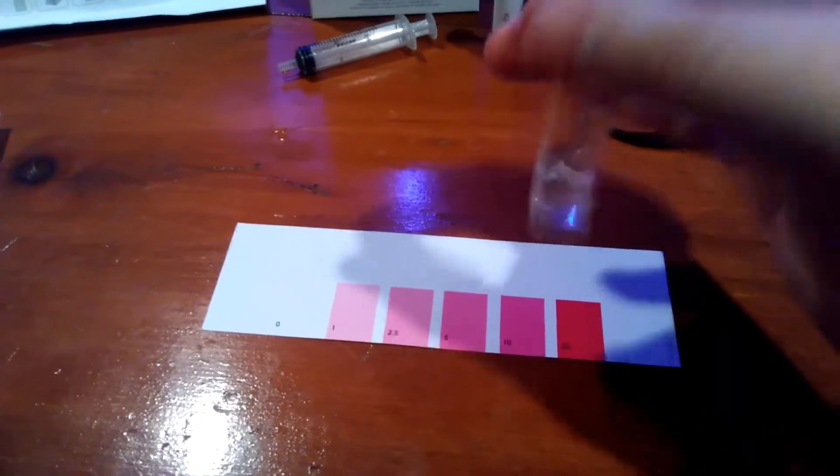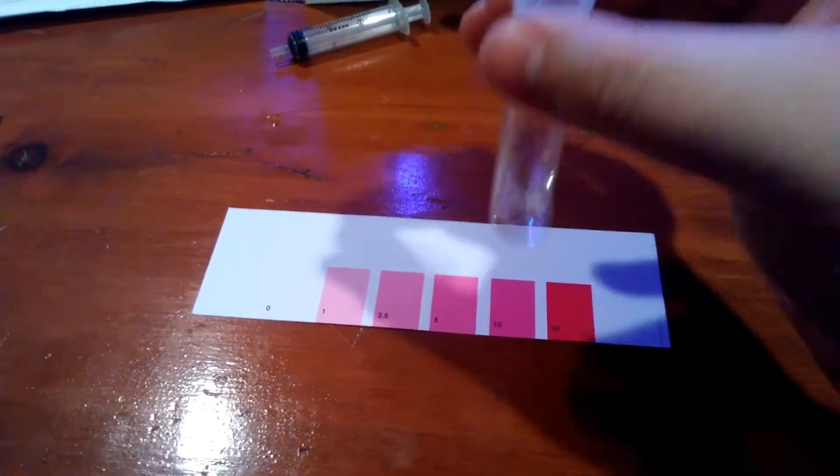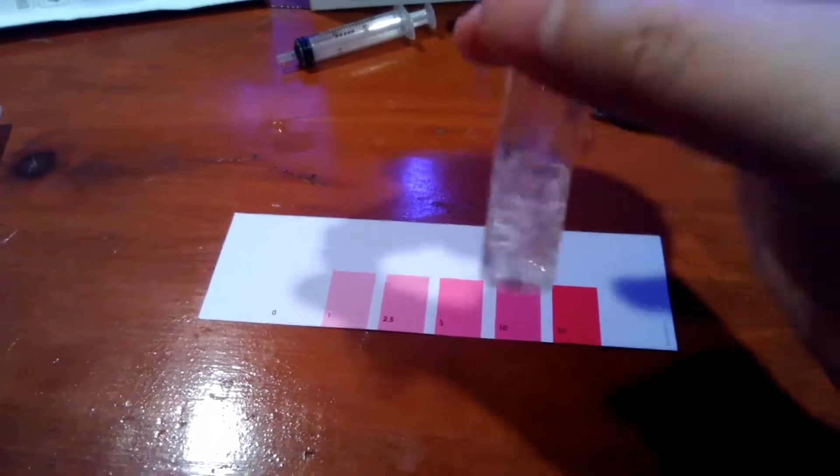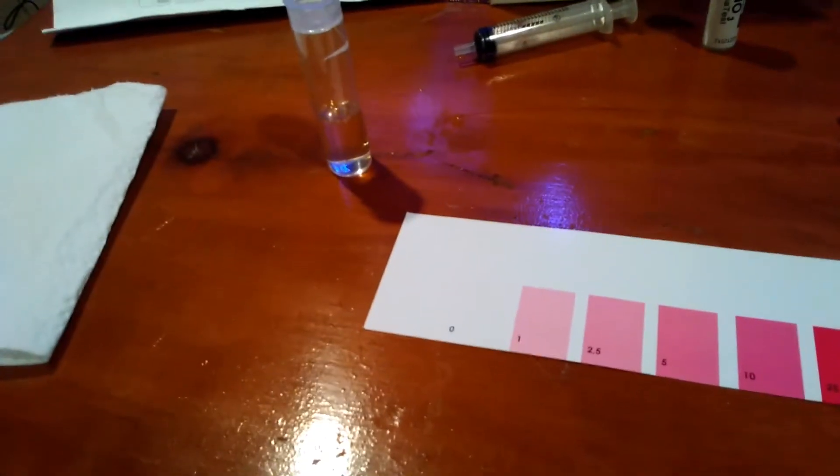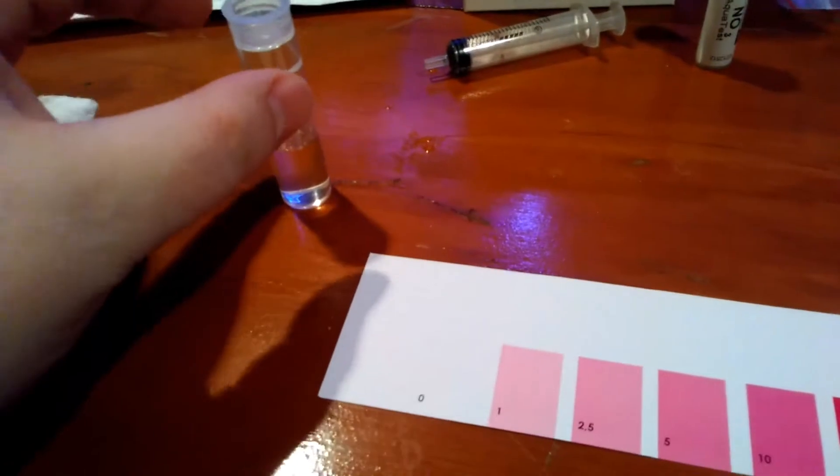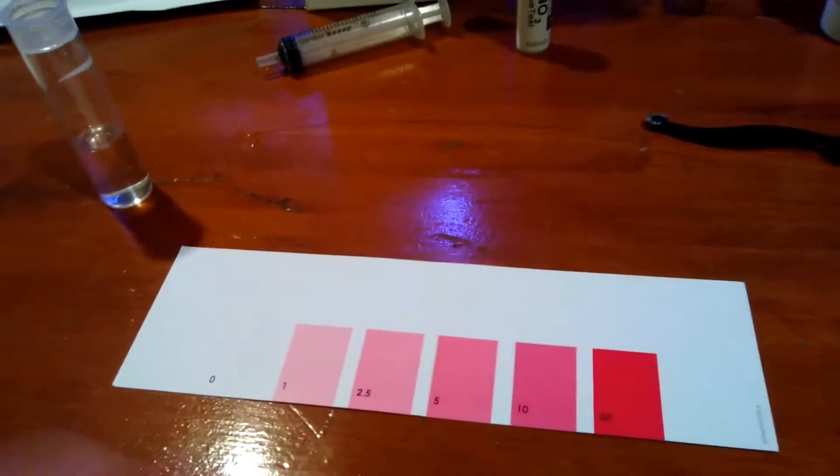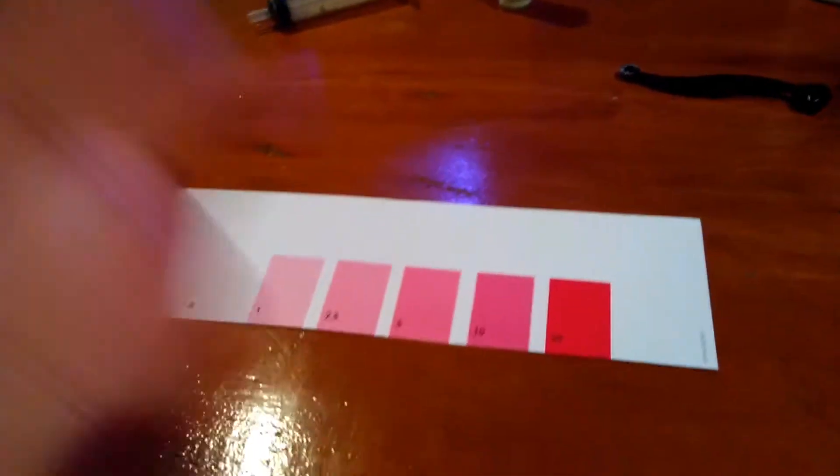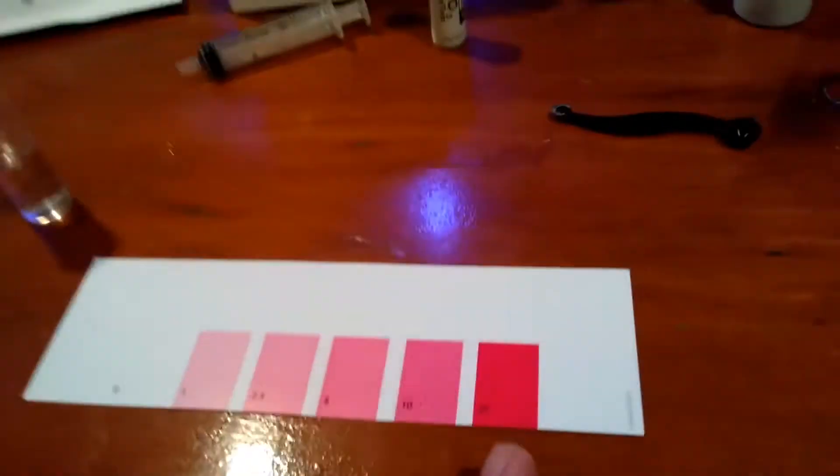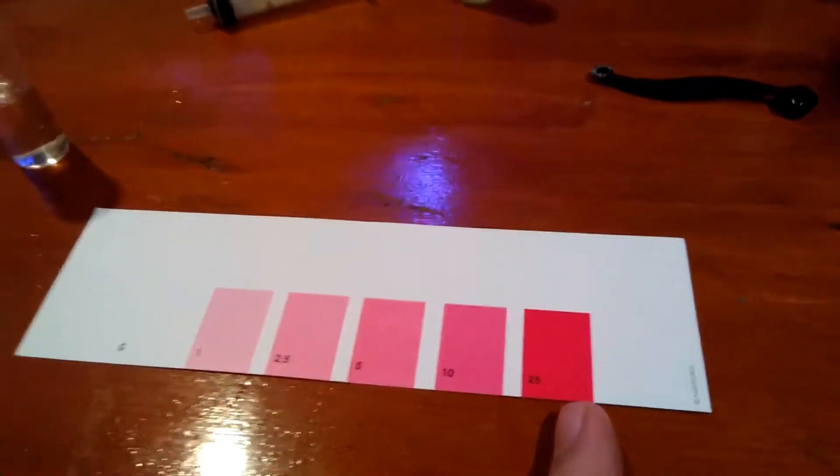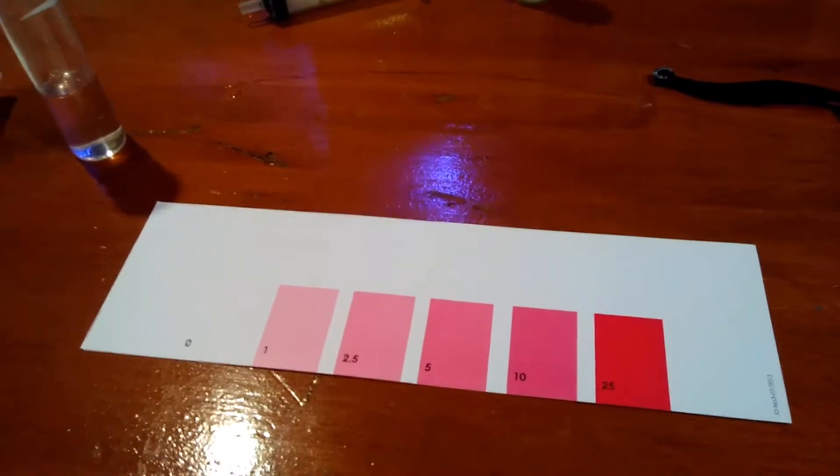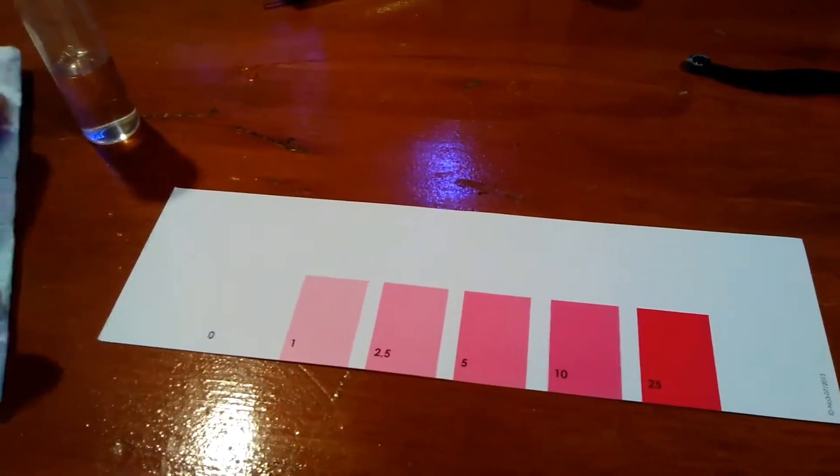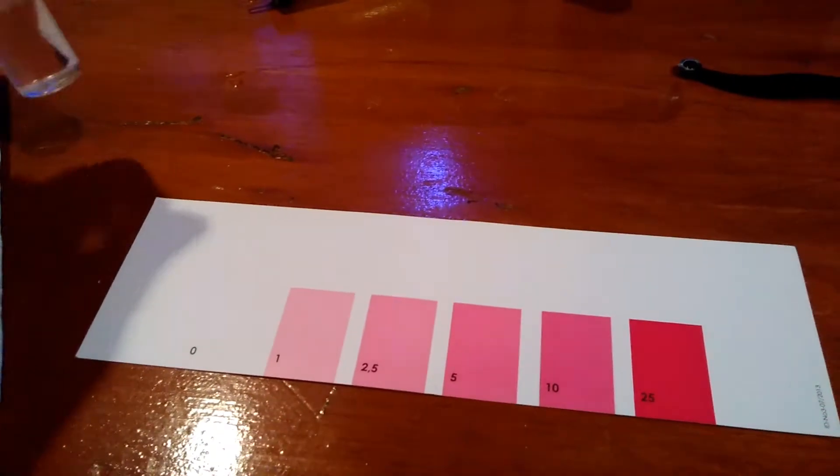Now I've got to say the color code chart is so great. It's very easy to read, especially at such a low number on each one of them. My tank water is pretty good all the time. I actually do water changes, so this is perfect for me. This is where you're pretty much in trouble with your tank. You're going to get more headaches when you go beyond this point. So try to keep up with your water changes. That's the best thing I can say to you - it keeps you away from the headaches.